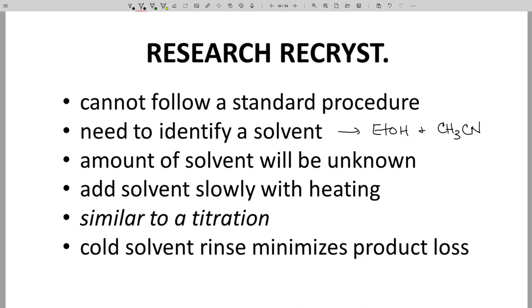In order to minimize the amount of solvent used, solvent is added slowly to the heated crude mixture until everything dissolves. This is much like a titration. Add acid or base until you reach an endpoint. In a recrystallization, you add solvent until you reach an endpoint. The product dissolves. Cooling then precipitates the product. During filtration, it is important to use cool solvent during washes to avoid re-dissolving the product in the funnel.